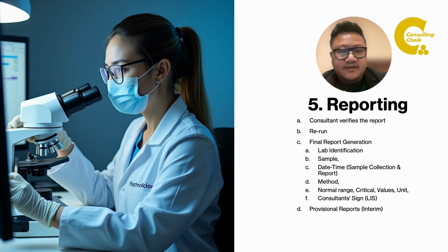If it is coming abnormal, then it will be highlighted differently, and if it is abnormal and also goes beyond the critical level, then it has to be highlighted differently. And then the consultant's signature is required, and if it is through LIS, then the signature comes automatically.